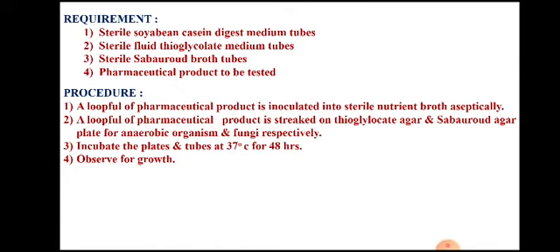So here we'll be using the direct inoculation technique, and the product that we'll be using is water for injection, that is WFI. Water for injection comes with the powdered antibiotic vial. This water for injection is taken in a syringe and injected into the vial of antibiotic where the powder is present, and then the suspension is prepared and injected. So we'll be using that water for injection as a sample.